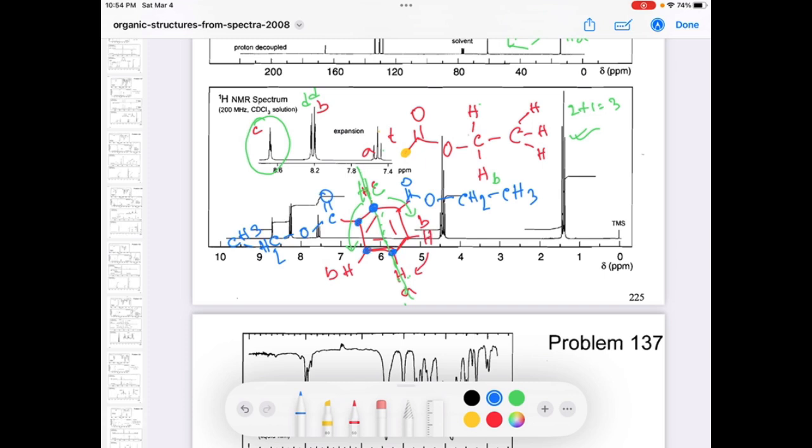So the HC carbon and HA carbon are two different carbons, and this ester group containing carbon and also the HB carbon are different. If I put the numbers here, this is 1 and this is 2, this is another 2, and this is 3, and this is another 3, and the last one is 4. So a total of 4 different carbons you will see in your structure.